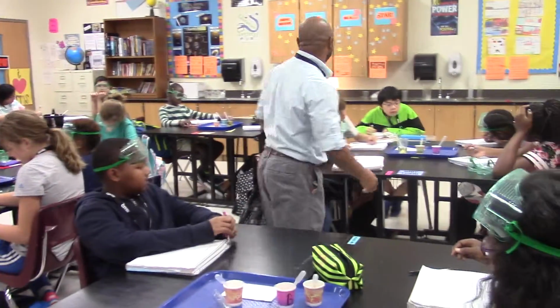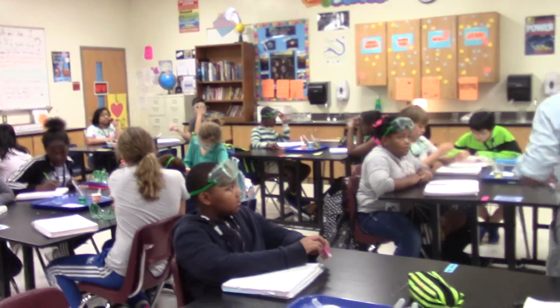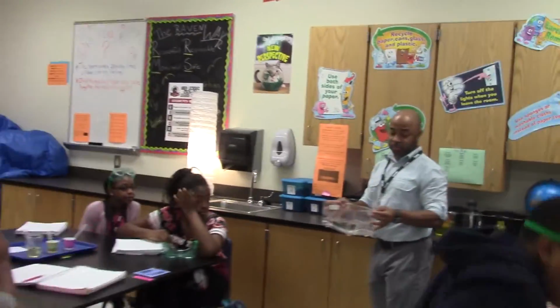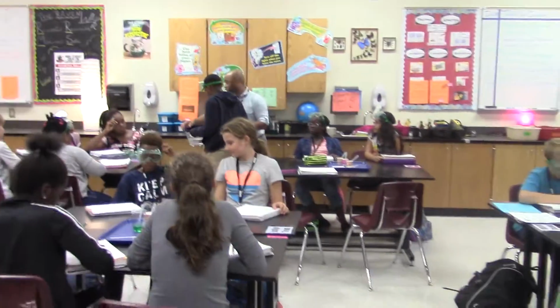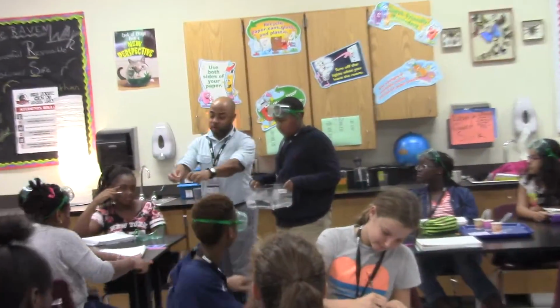So in today's lab, what we're doing is we're learning about the density of liquids. Now in our last lab that you guys did an awesome job on, that's why we're going to do this one, we did the density of solids. So Chris, if you would, come here, hold this for me. And we wanted to see which solids were more dense than water, all right? And we had 3 different solids. Carrington, hold these 3.